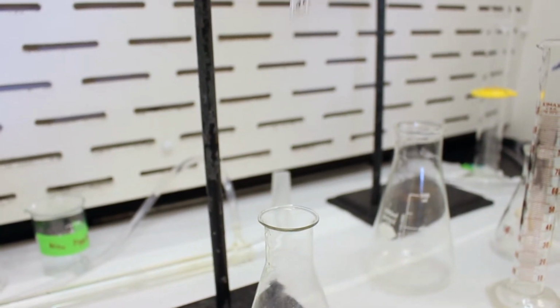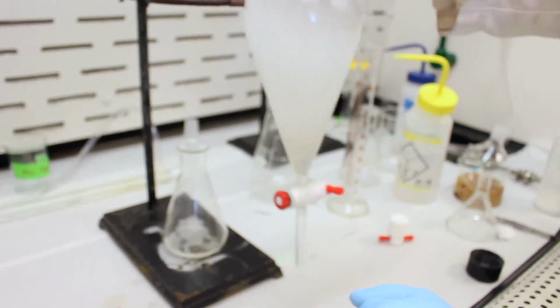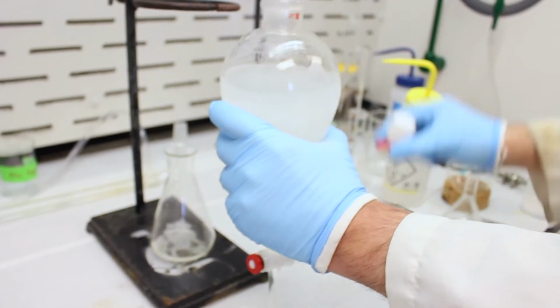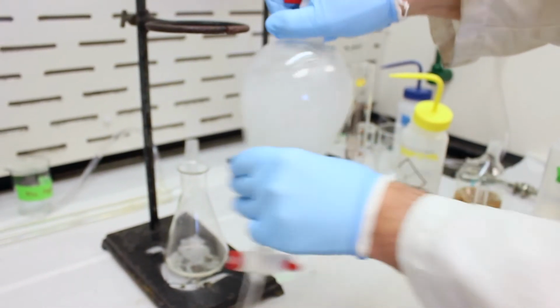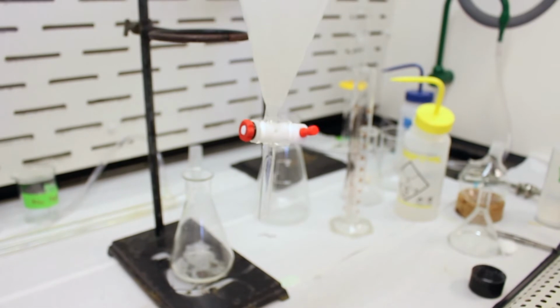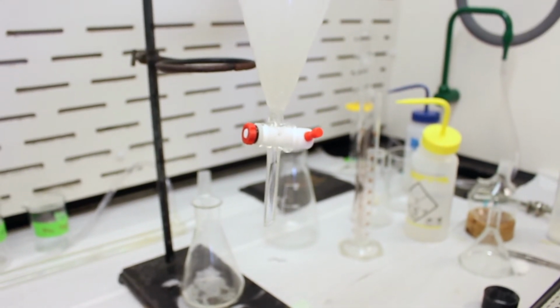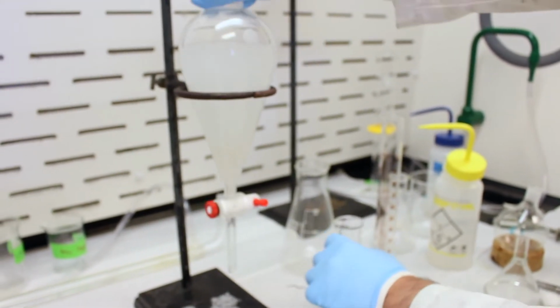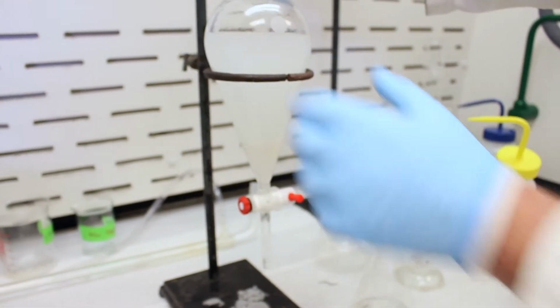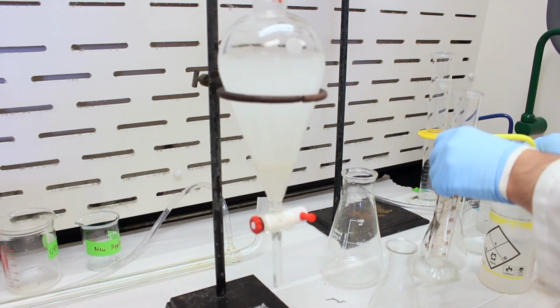Okay, so let's try to give it another swirl. Sometimes if you swirl it, the bubbles come back to their layer, so put the cap on so I don't spill any. Nope, didn't seem to work. That's all right. Let's just go on to the next extraction and try to get the layers resolved again.